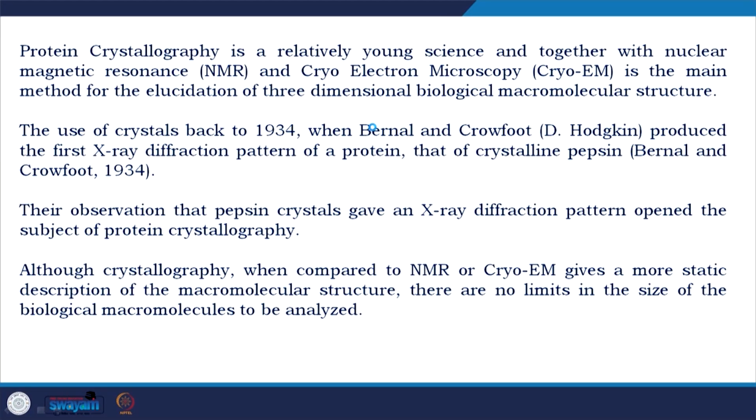Although crystallography, when compared to NMR or cryo-EM, gives a more static description of the macromolecular structure, that is why crystallography is always criticized for, there are no limits in the size of biological macromolecules to be analyzed once they are crystallized. I will talk about this in details, but in crystallography, the main barrier is crystallization.